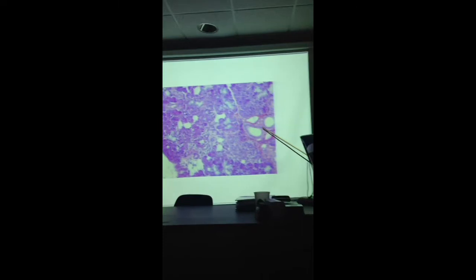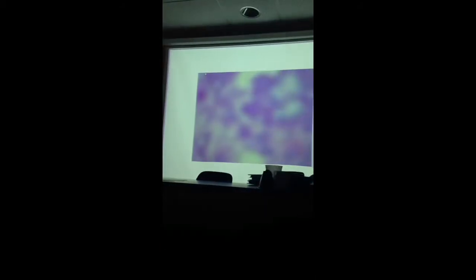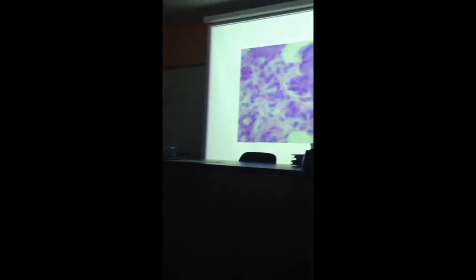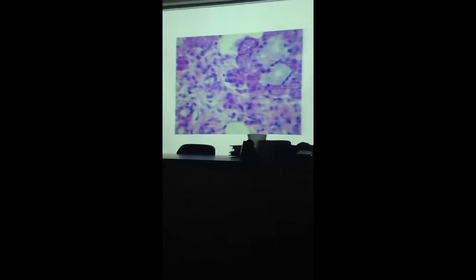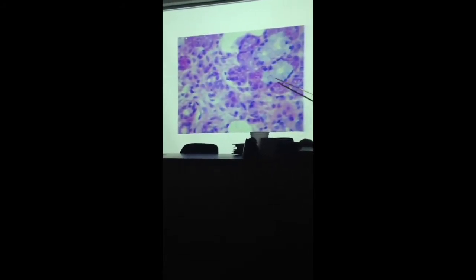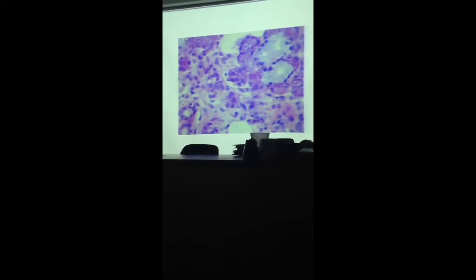We've also got a lot of ducts here. And these are salivary gland ducts. And how can we tell the difference between the salivary gland ducts and blood vessels, which we also see in these tissues? So here again, mucus cells, kind of gray, and then the darker stained serous cells. So we should be able to distinguish between these two.